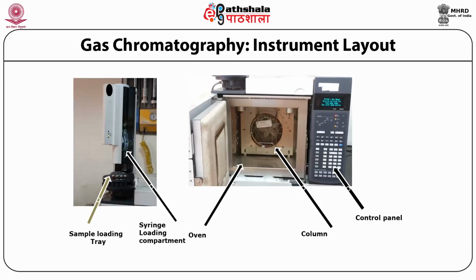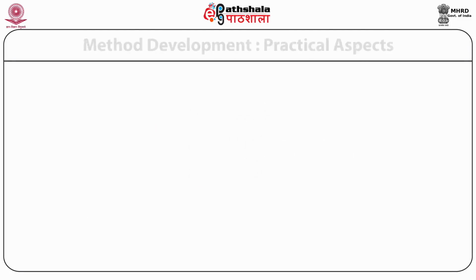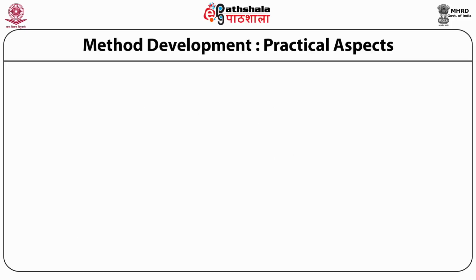that you want. All of this, of course, will be connected to the user interface for the software that runs and controls the whole chromatographic process, along with the software that allows you to do the final editing of the readouts that are obtained. Now, before one starts developing a method for a particular group of compounds that one wants to analyze, there are some practical aspects that need to be looked into.